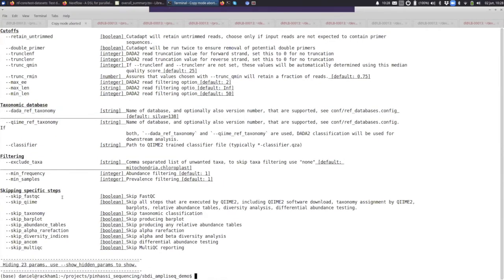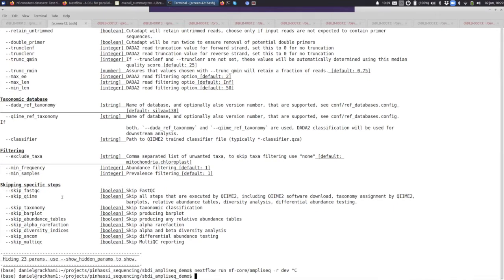So when you run Nextflow, you can either give arguments like this. So I can give it that -input and specify where the input is. Or I can write the configuration file. And the configuration file is, of course, in many ways simpler because the command line tends to become rather long, and the configuration file also has the strength of keeping your config, so you know what you did.